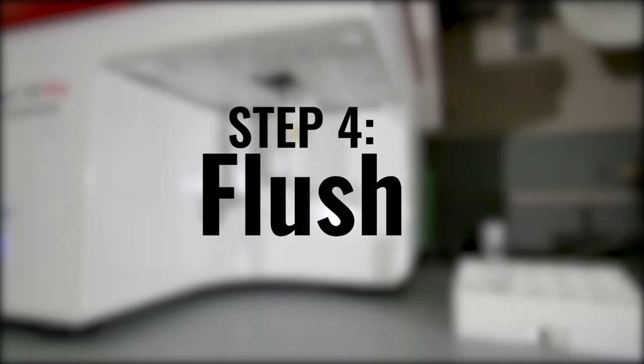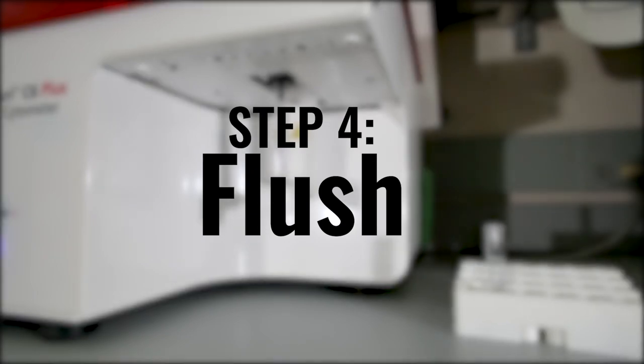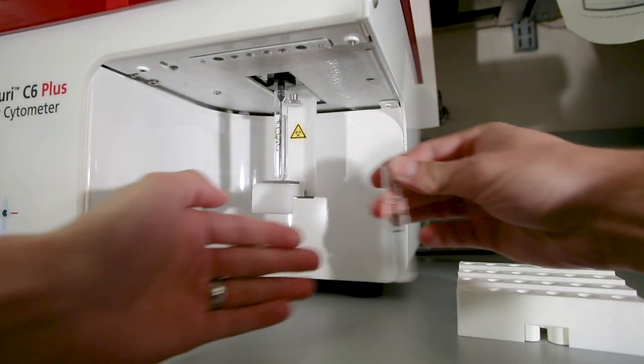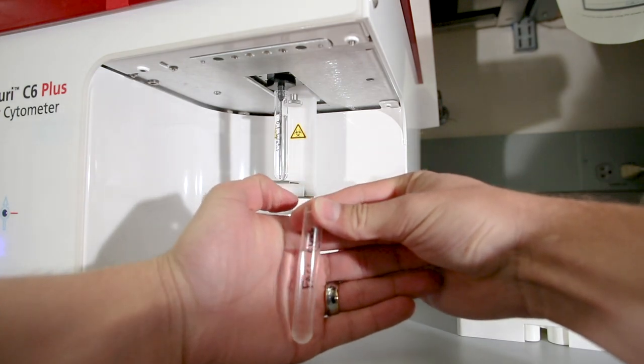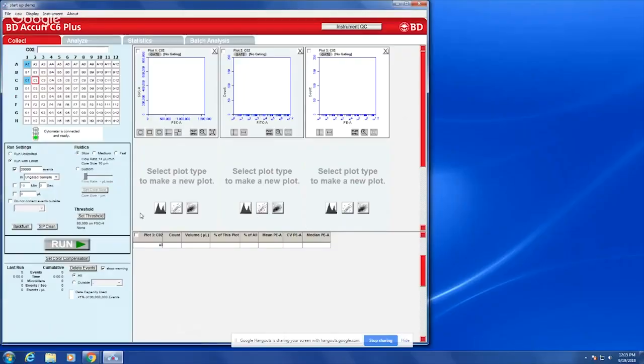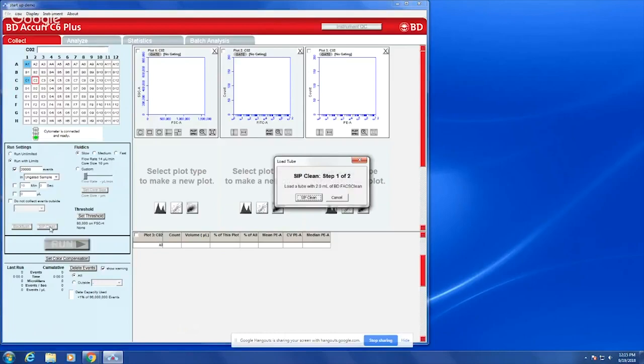Tubes of Fax Clean solution and filtered water should be near the machine. Put at least two milliliters of the solution to run in a clean tube. On the computer, run the sip clean function. It will prompt you to put on a tube of Fax Clean solution for five minutes and then DI water for five minutes.